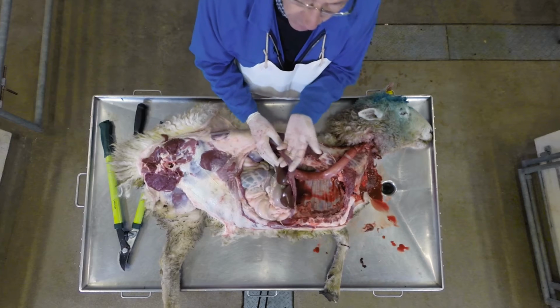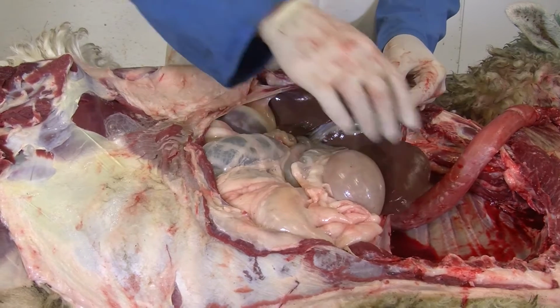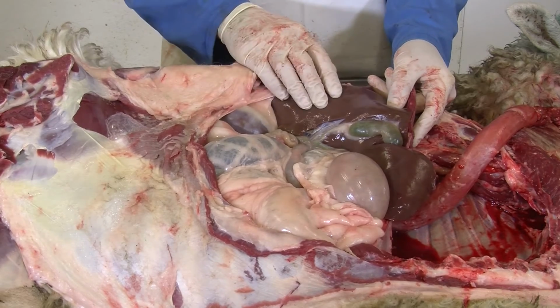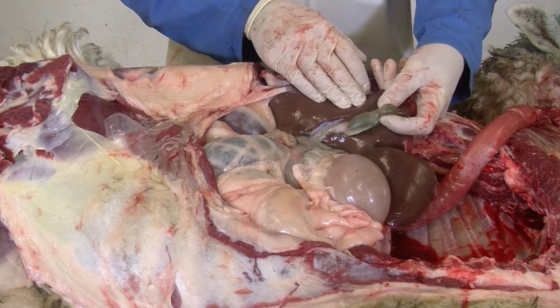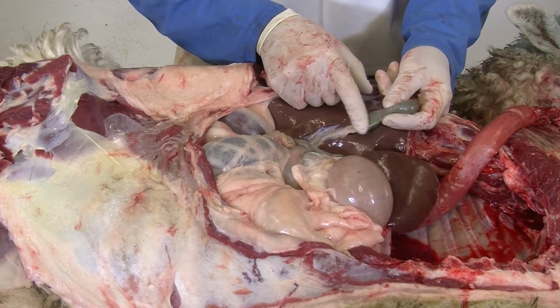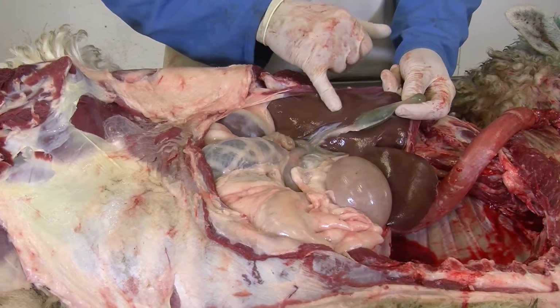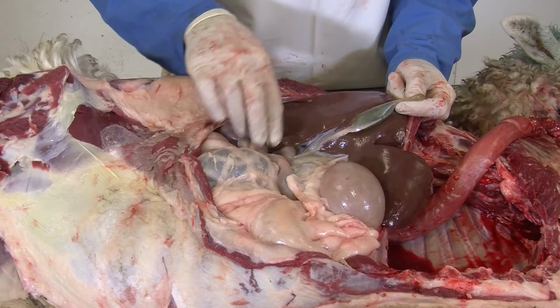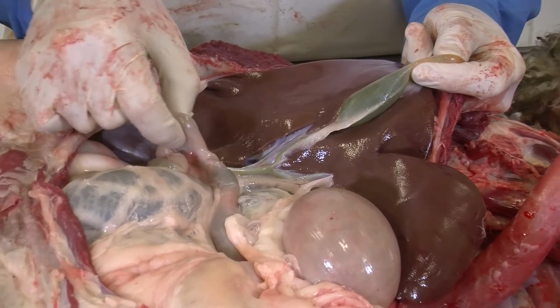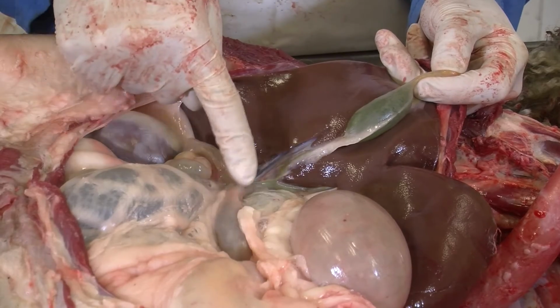So I'm holding on to the diaphragm. Right underneath the diaphragm here is the liver. This dark red structure, a lot of you will recognise that, is the liver. On the underside, which is what we're looking at, this thing here, it's just like a little balloon with green fluid in, is the gallbladder. And I don't know if you can see, but there's a little duct going from the gallbladder into here. This is the start of the small intestine, this structure here.